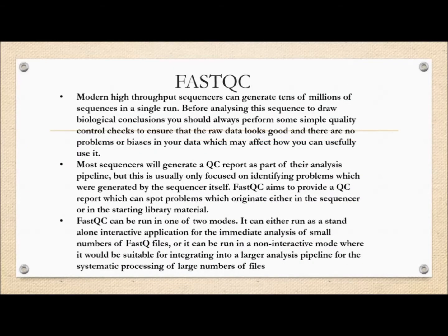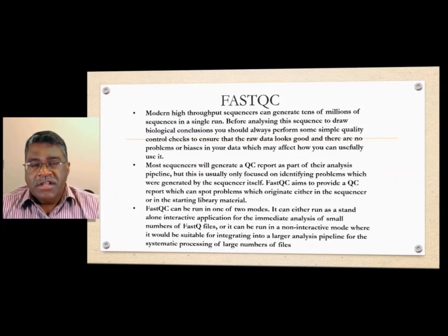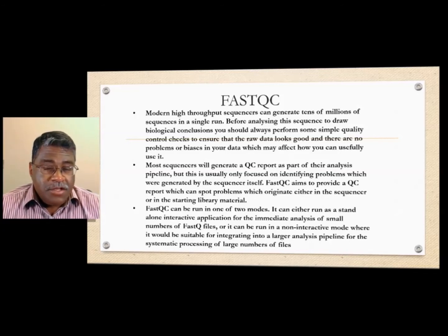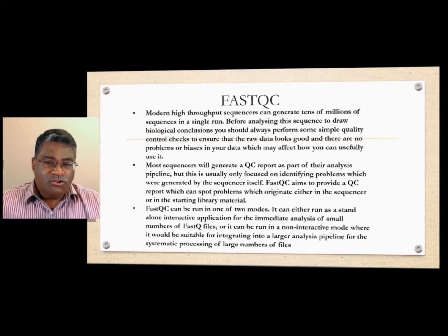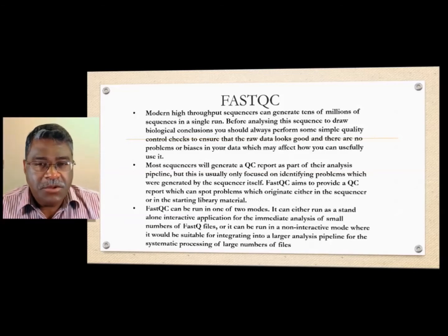It's important to begin to understand quality control. Remember, this is a long process. This is a process that is getting better, but there are some built-in systematic errors because it's part of the machinery, part of the methodology, and the results are associated with uncertainties. That's why the FASTQ format, for example, gives you such a huge range of quality scores related to the assembly of these reads.